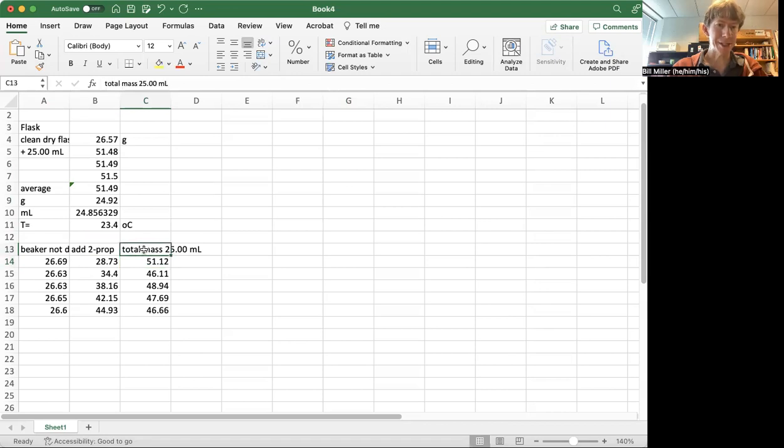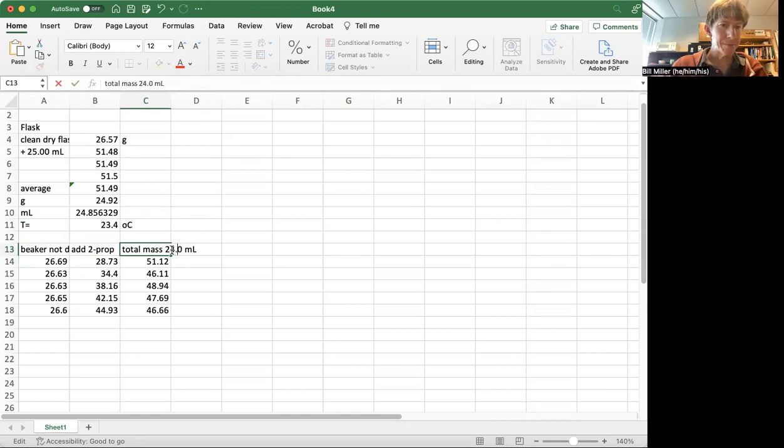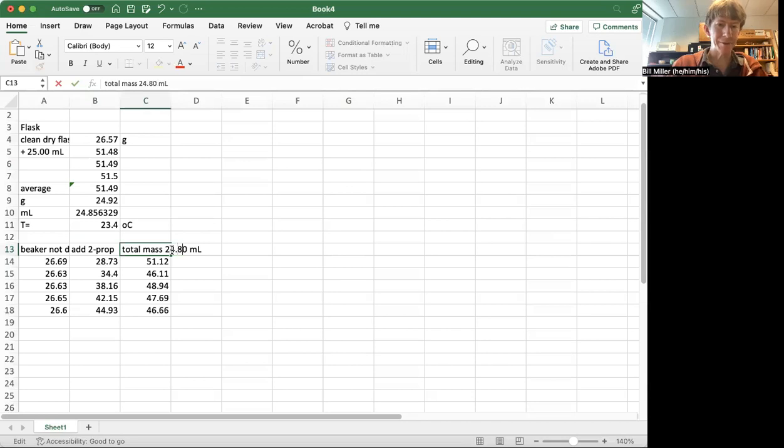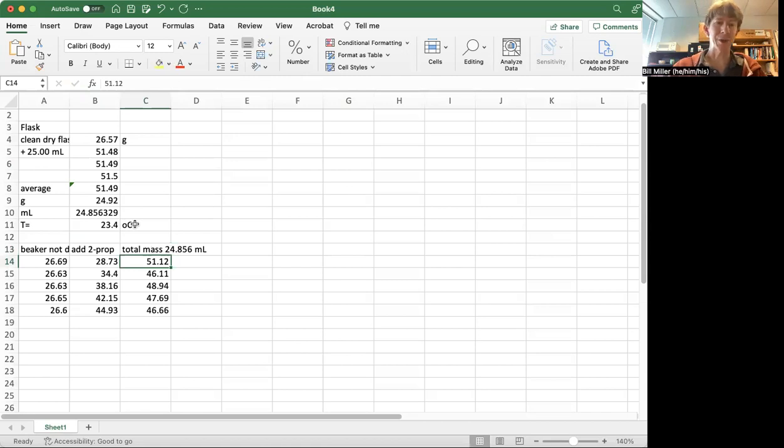And that I should write is actually 24.85, 24.856 milliliters, because that's the number of milliliters I got, not 25. And I'll have to use that number later in my calculations.